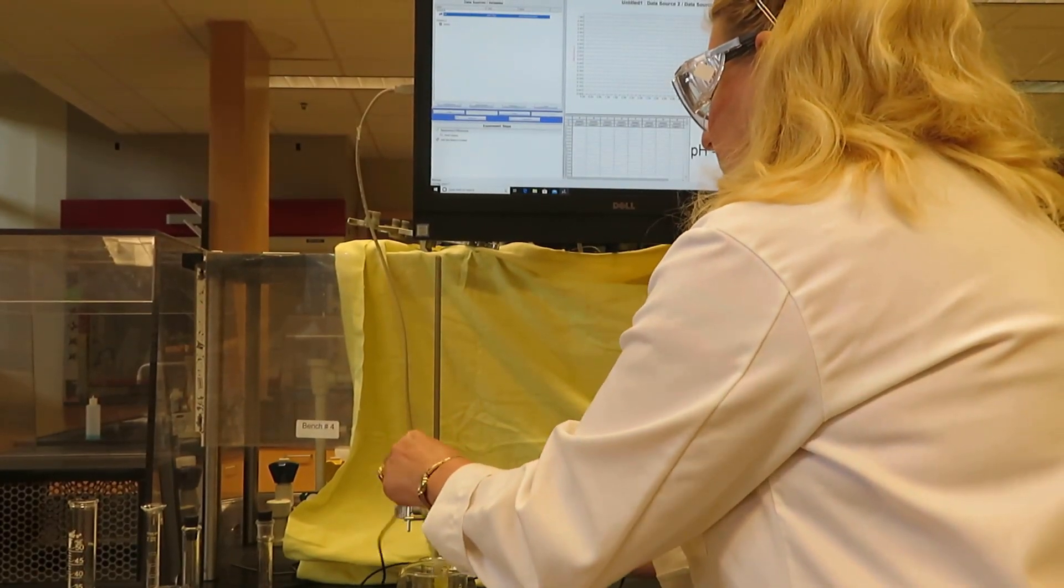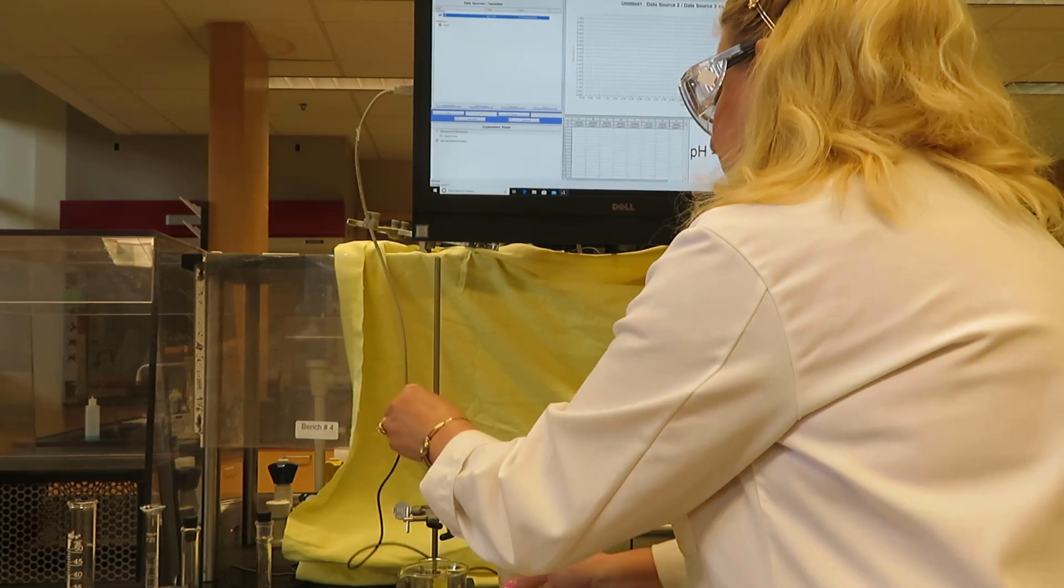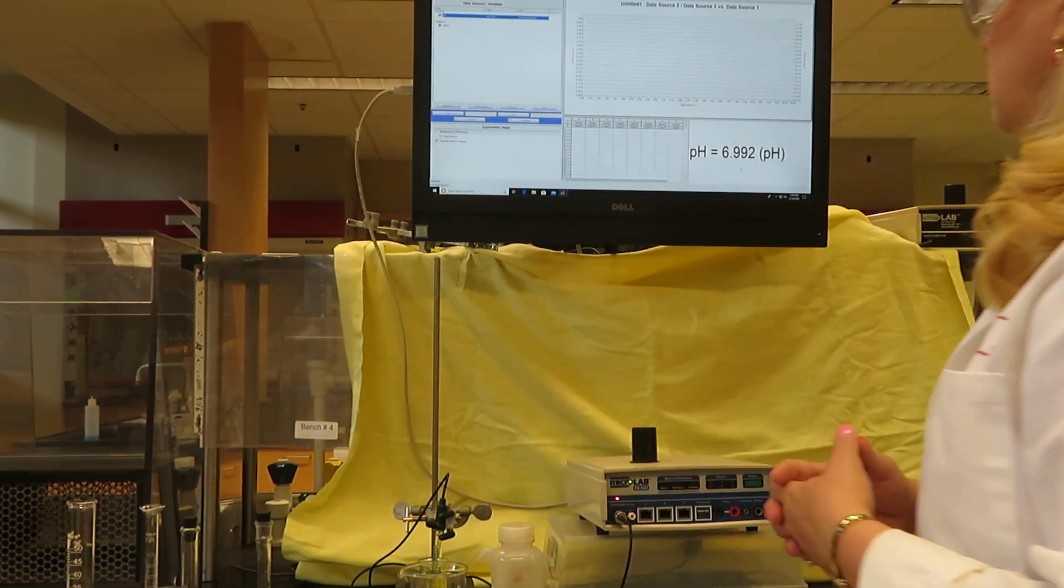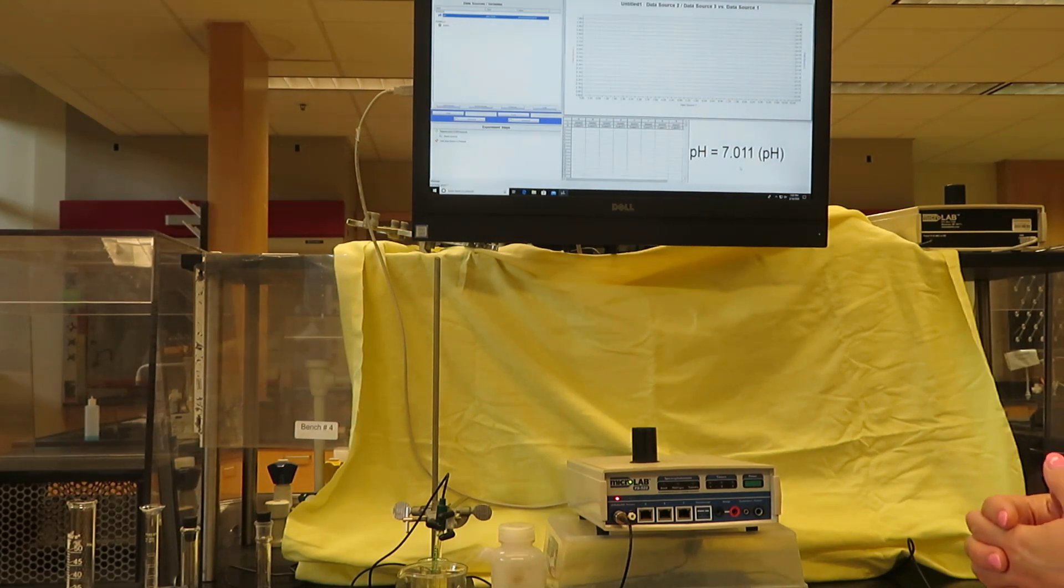Now let's try our pH 7 solution. Give it a minute to stabilize. It seems to be stable at 7.025.